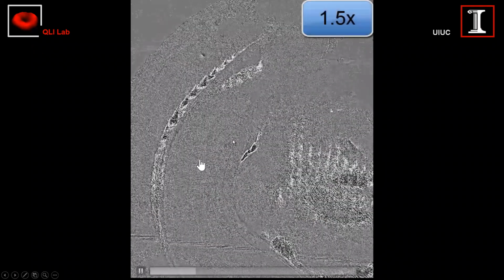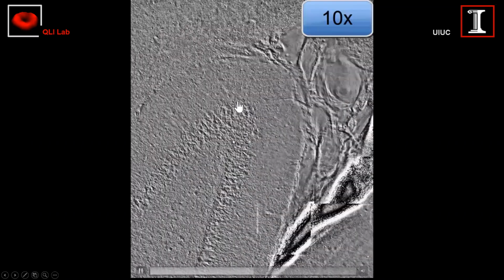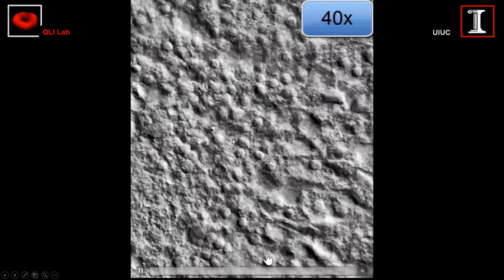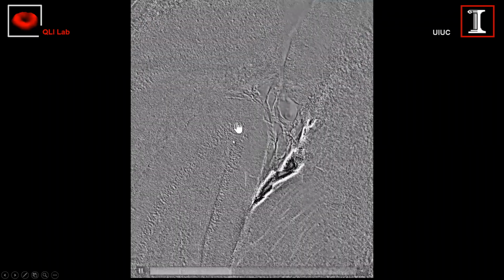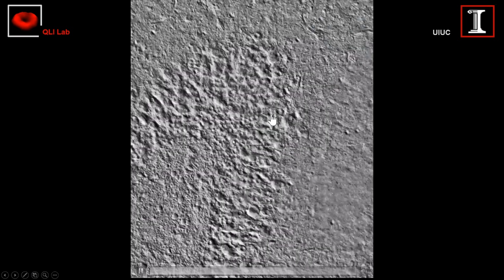What you're looking at here is actually hippocampus. We're focusing on the hippocampus. This is responsible, as you know, for the memory formation and so on. So we mounted one of these GLIM instruments onto an electrophysiology system in a neuroscience lab, and we collected data and we looked at circadian rhythms, this day and night periodicity that happens in the brain.